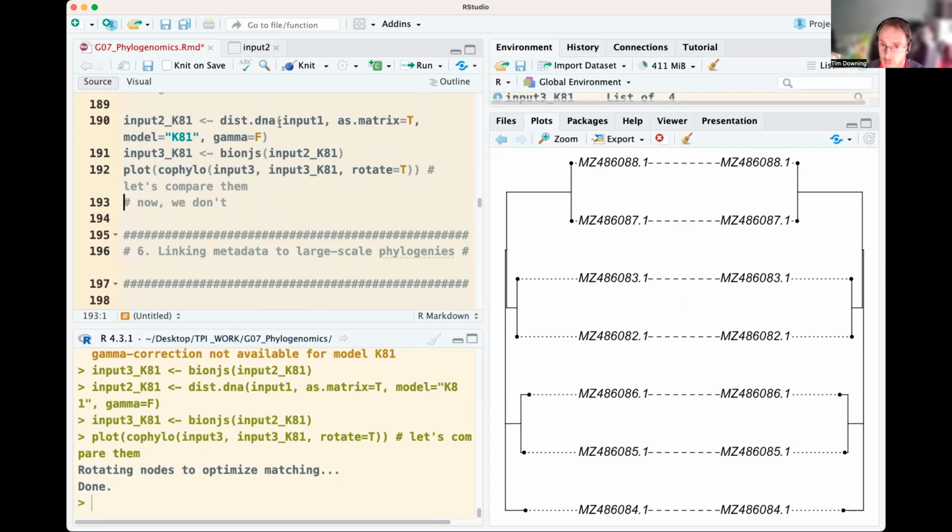So that's where cophylogenies can be very useful for, say, comparing the phylogenetic signals across different sites, especially for recombination detection. You might have your core region of interest, and you compare that to something that is a potential recombinant against this core, and representing that as a cophylogeny is an ideal option for that. So please see Lab 2 for more details on how to further develop your skills of visualizing phylogenies.